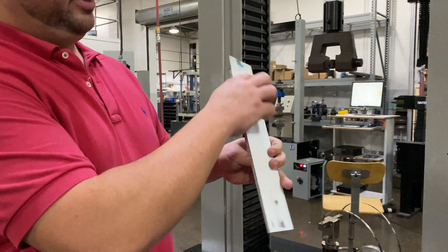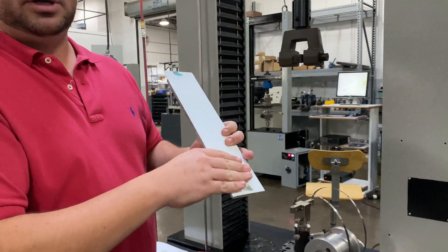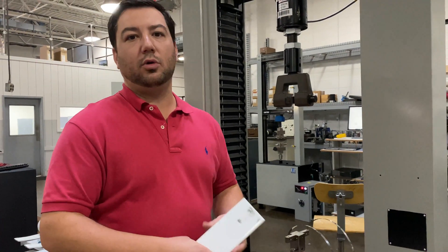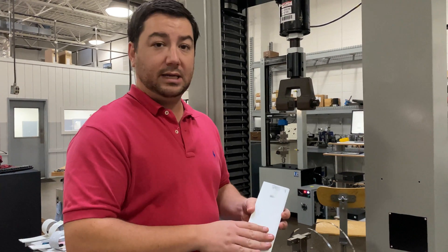This laminate will then peel around the drum as the drum climbs up the material and give you an average peel torque or load for the adhesive.